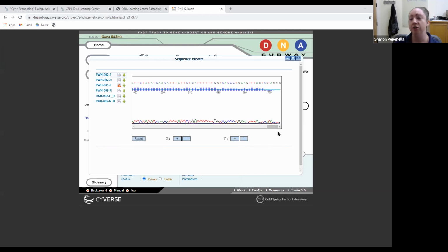On the other side, you're then starting to run out of the ddNTPs, depending upon the length of the sequence that your polymerase is trying to sequence. You might start getting misincorporations or mutations in the actual sequencing. That depends on the fidelity of the polymerase you're using, and so on. So that can lead to lower quality sequence at the end.